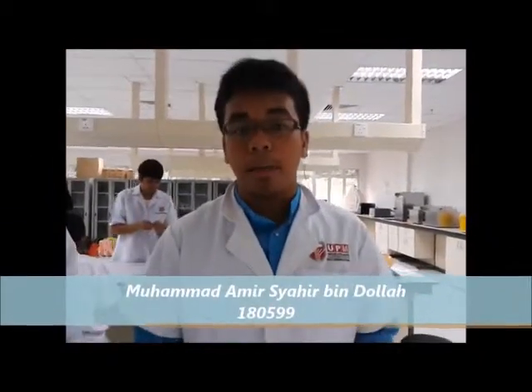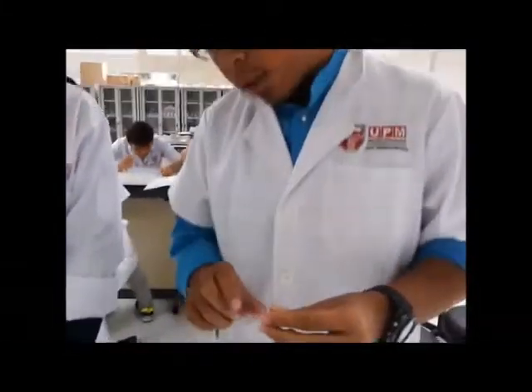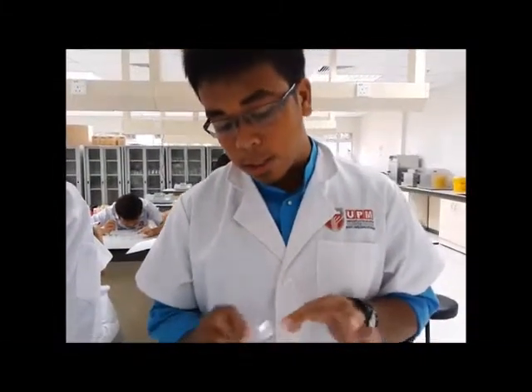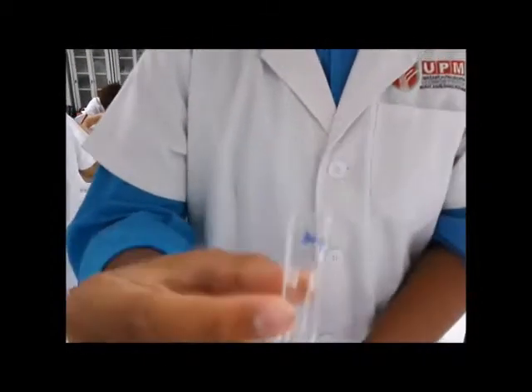Hello again, my name is Amir Shahir and I'm going to talk about our first step. Okay, the first step is we need to label the cuvette, which first is start, and then the next part we need to label it E1, E2, E3, E5 and E7.